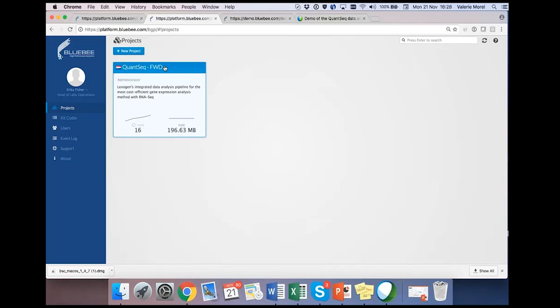It's the Ensembl annotation of human, mouse, rat, and pig. You can select for these species, but you cannot change the parameters for HTSeq count or something like that. Of course, you can add a new species anytime there's the need for it.